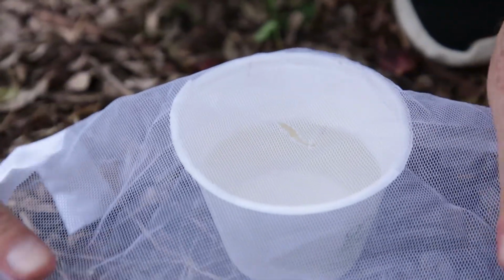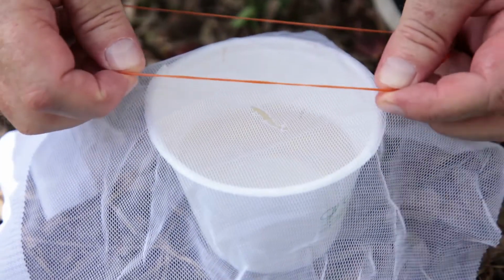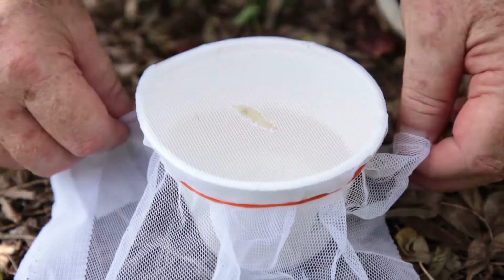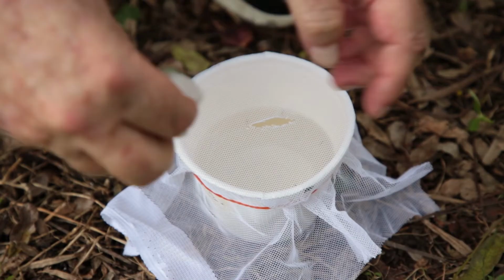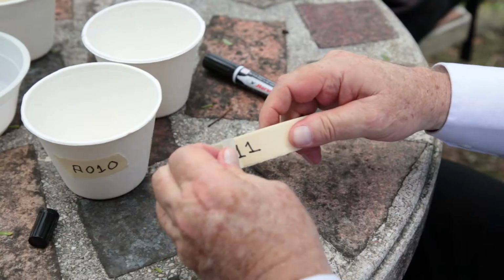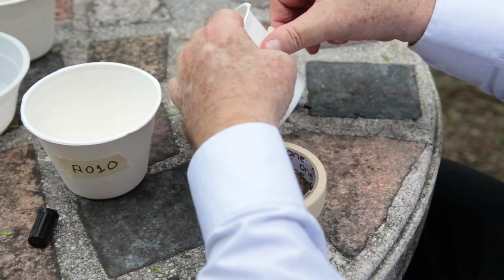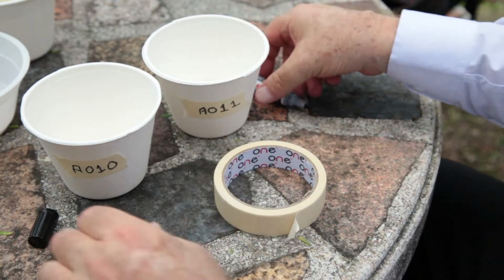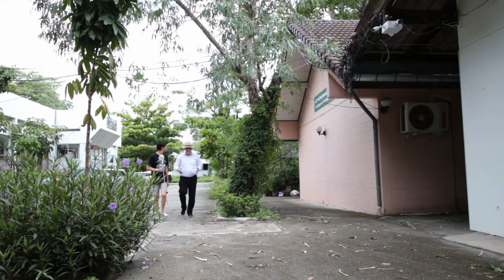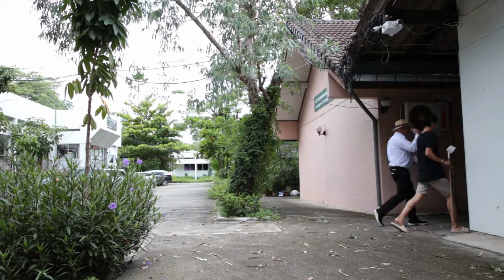Now cover the container with netting. The netting must have a slit in it so you can insert an aspirator when an adult mosquito emerges. Block the slit with cotton wool so adults cannot escape. Always label the cup, even if it is just a code to link it with the full collection data in your spreadsheet. Keep the cup with larvae in a warm but shaded site away from direct sunlight.